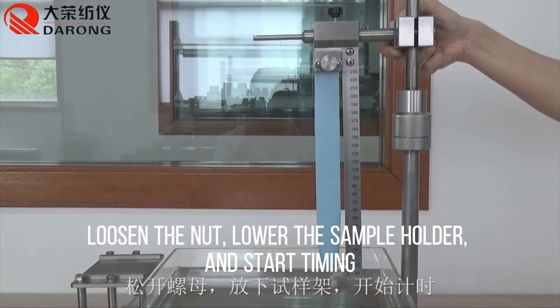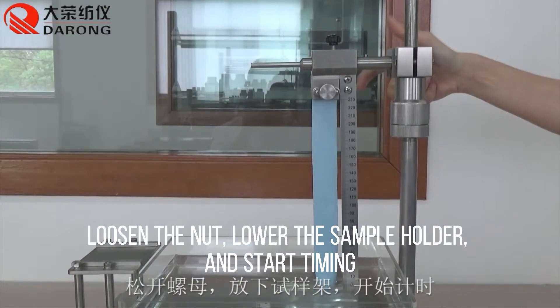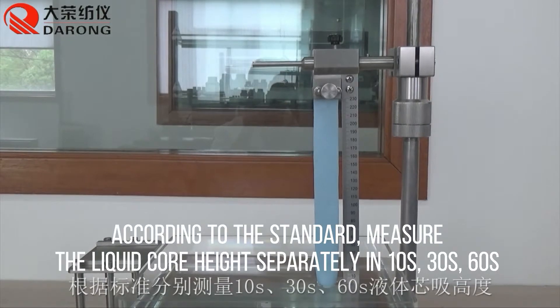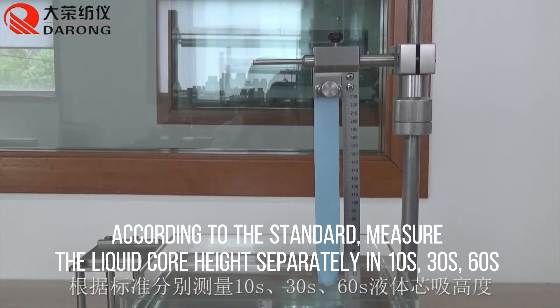Loosen the nut, lower the sample holder, and start timing. According to the standard, measure the liquid core height separately at 10 seconds, 30 seconds, and 60 seconds.